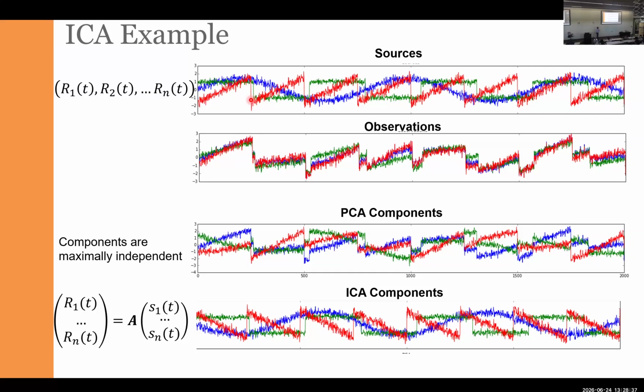The caveat with ICA is that in most cases, for the data sets that we are working with, whether it is EELS or STM or STS, the fundamental assumption of ICA is not fulfilled. So at least in my experience, once we deal with spectral data or image analysis, it was almost useless. You could get the data, but then it is important to explain what it means.